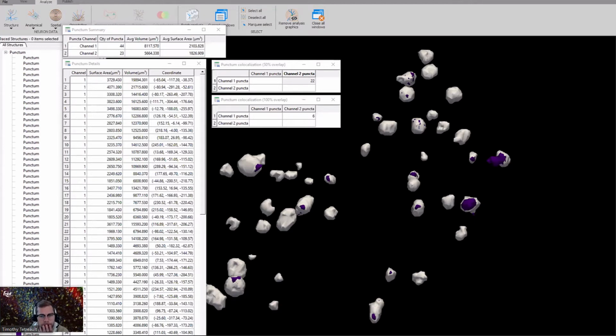Aria had a question that she sent in a while ago, so I apologize about that delay. Compare fluorescence luminance strengths of spines in one channel. Is the Puncta tool the one I need? What's the difference between this and the contour feature? Great question. So if you're looking at luminance strengthened spines, I would assume that you would probably want to use the spine detection.